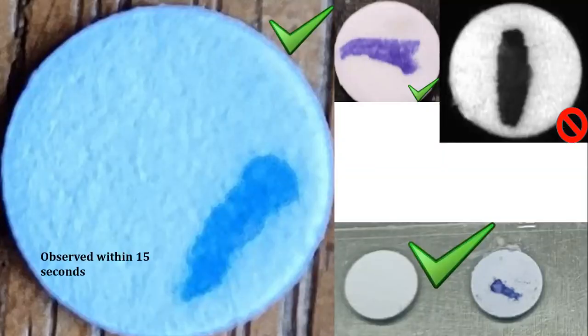Go for oxidase. These days, oxidase discs are available. So pick up a bacteria, smear it on the disc, and wait for 15 seconds to observe the disc turning purple, indicating oxidase positive. If not, it is oxidase negative. If any reaction happens after 15 seconds, they are false positives. I would suggest do not consider them.